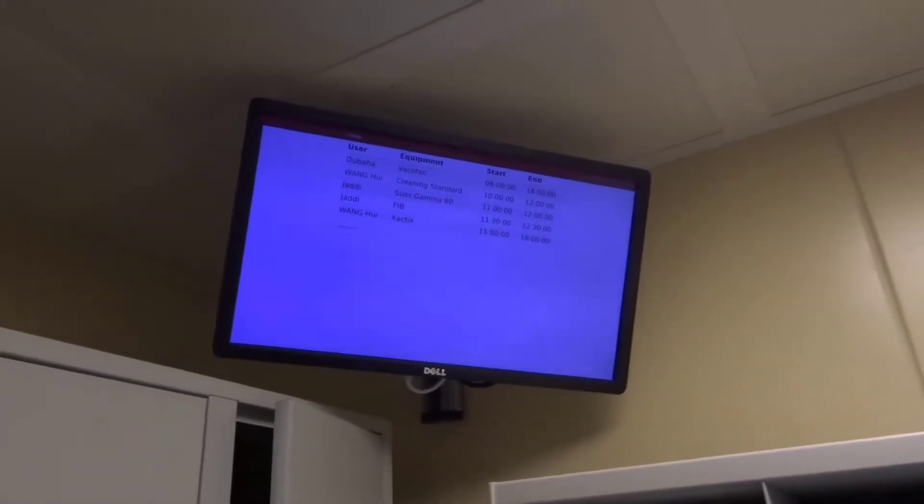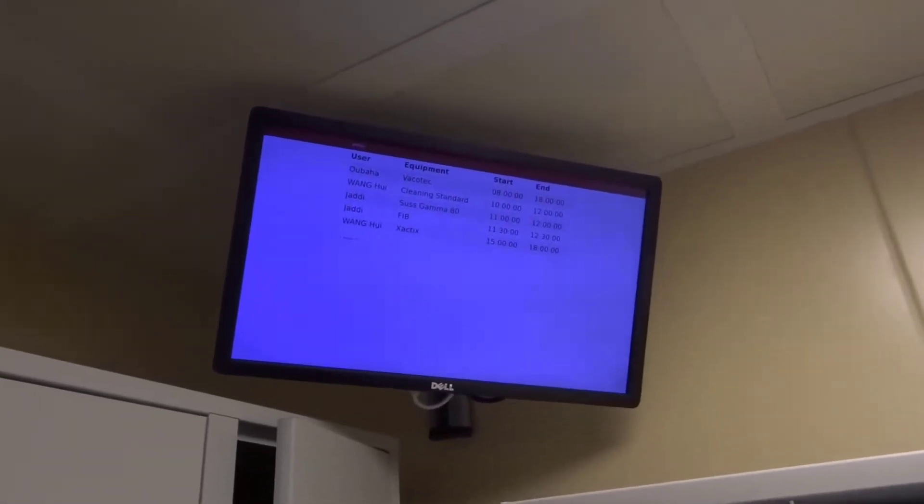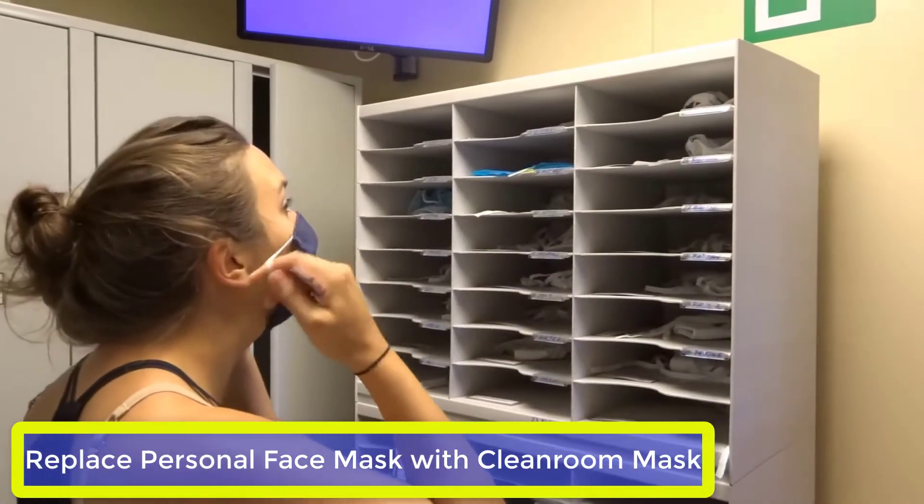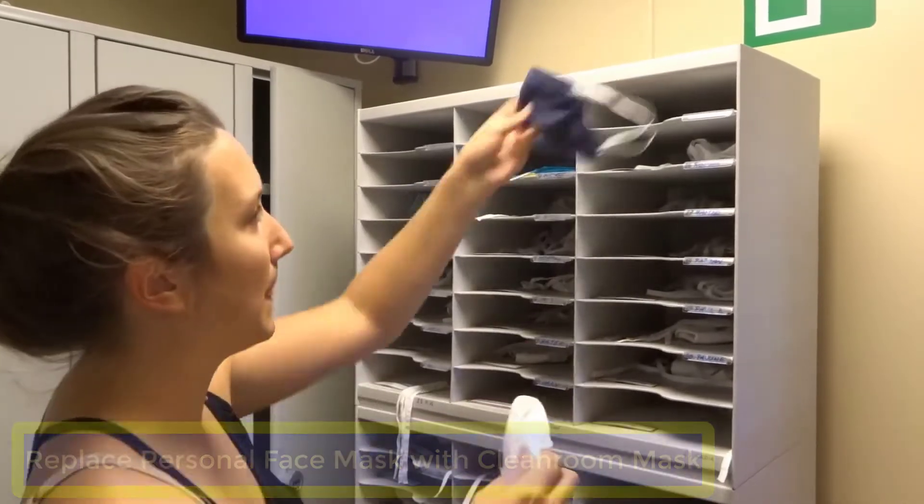Always check the screen to verify that you reserved your equipment. Remove your personal face mask and use the cleanroom mask instead.